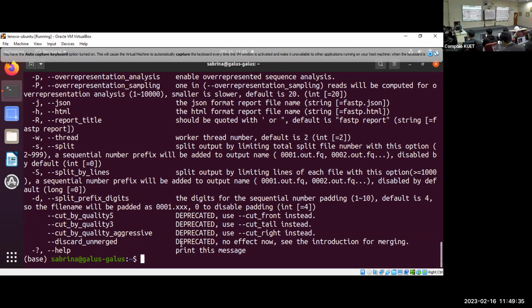Okay, so before the break, we were trying to send this folder, the first Q analysis folder, to our HPC account, each of our individual accounts. So how many of you were successful in doing so? Okay, so those of you who could not, maybe we can write the command again.